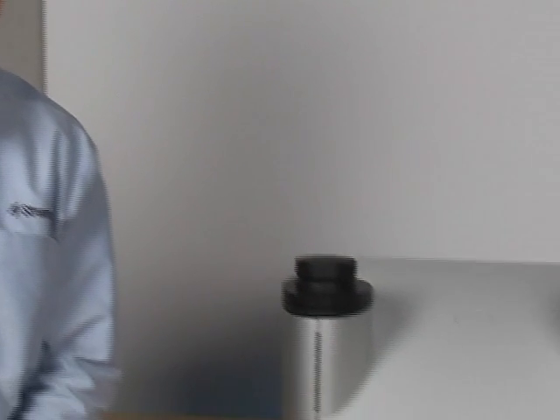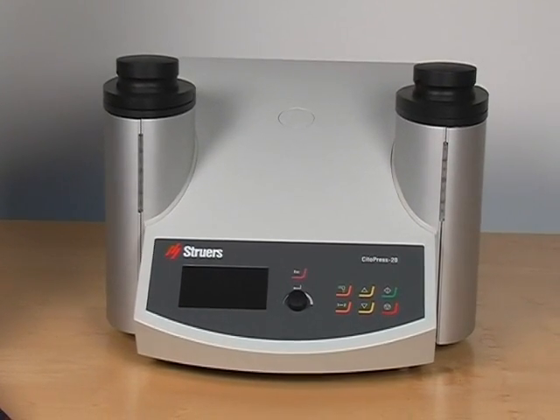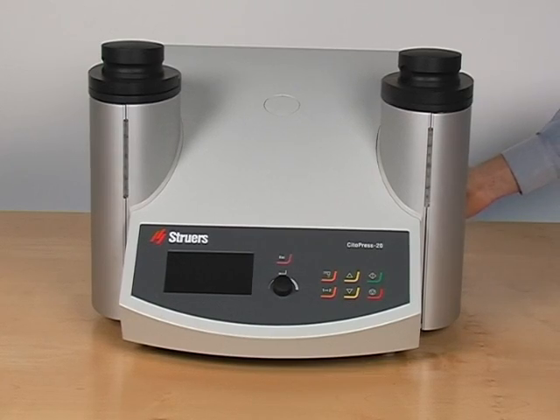Hello, we are proud to introduce CITAPRESS, the world's fastest mounting press. In the next few minutes we will take you on a tour into this remarkable product. CITAPRESS is setting new standards, not just in terms of speed, but in terms of ease of use and user-friendliness.